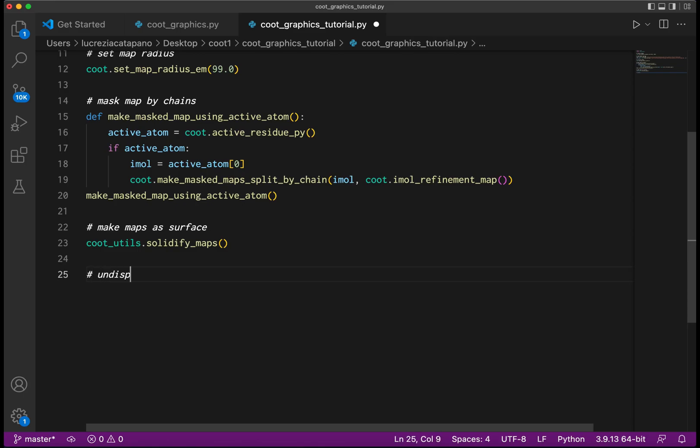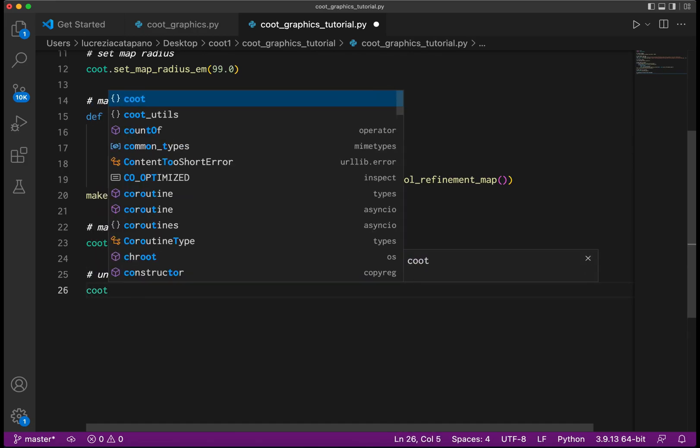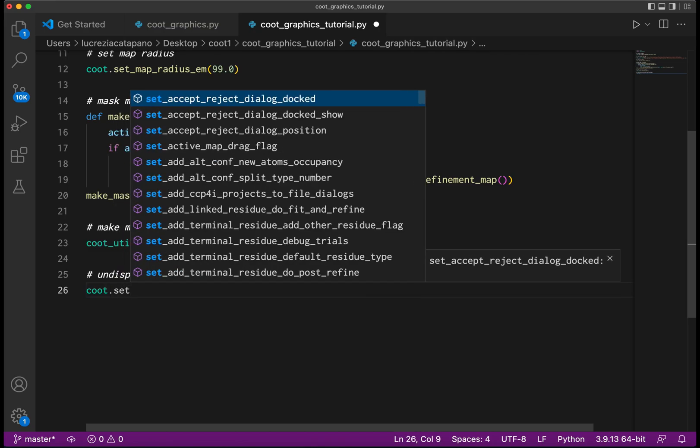Now let's undisplay the original unmasked map by giving the set_map_displayed function an argument of zero, and let's undisplay also the model.